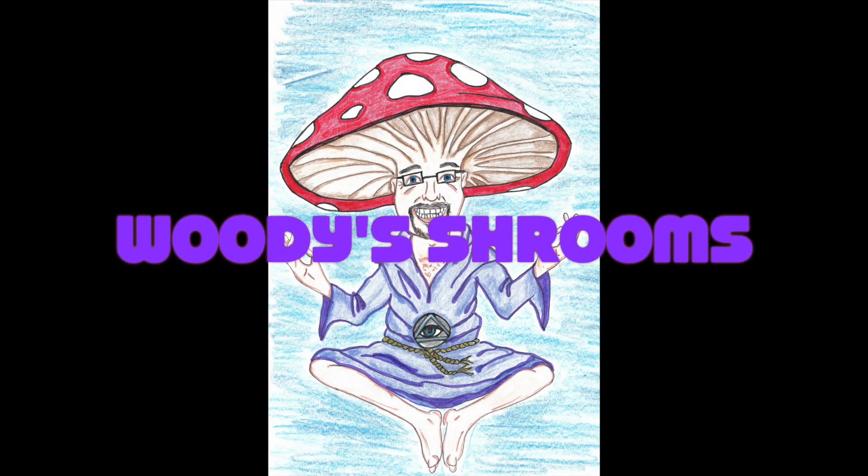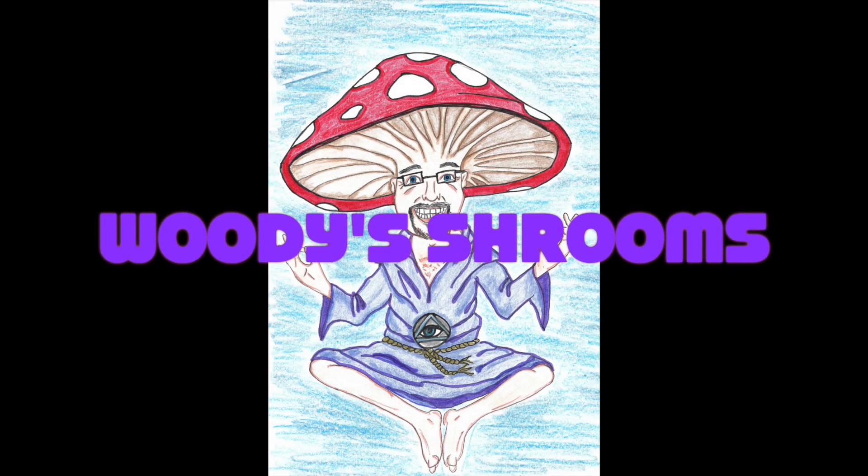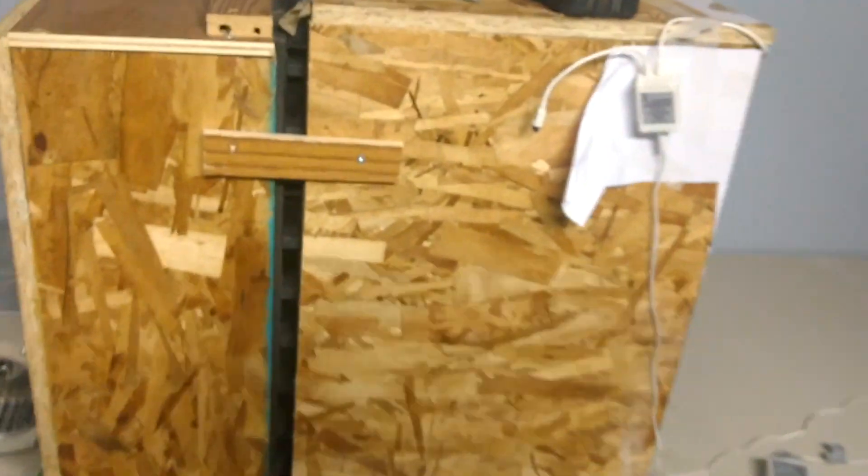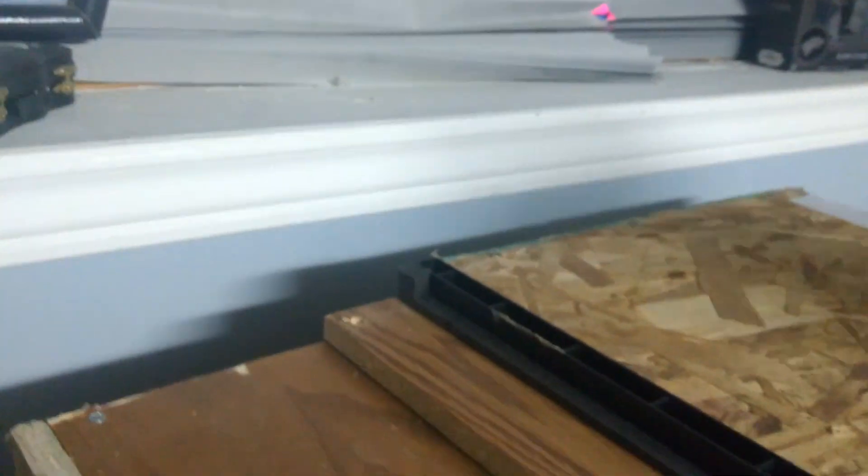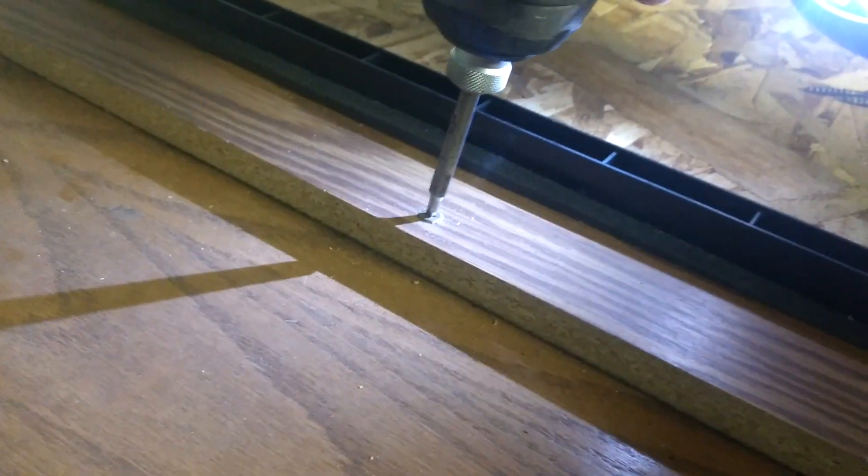Welcome back to Woody Shrooms. I am Woody. Today I'm going to be taking apart and changing the filter in my flow hood that I made and designed.